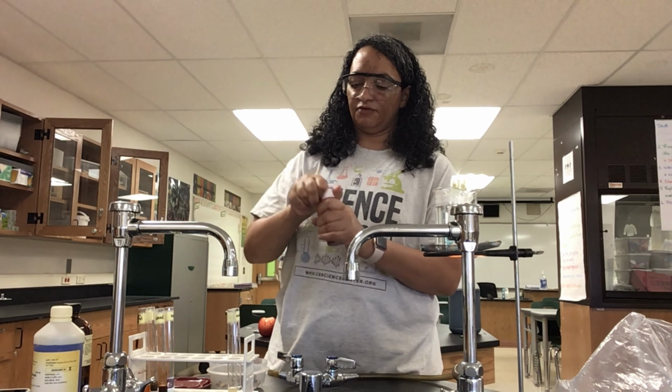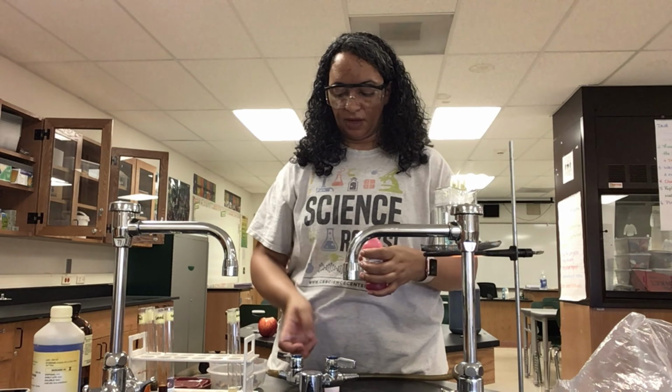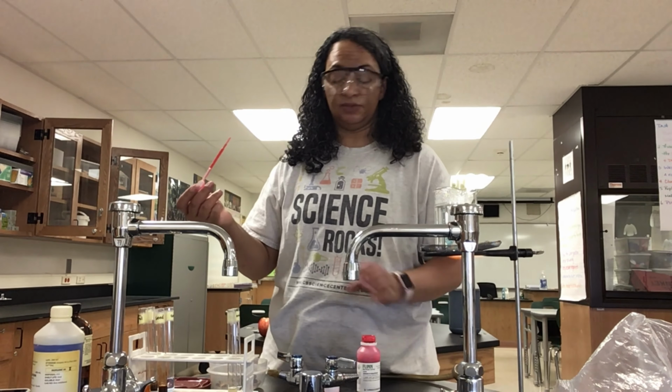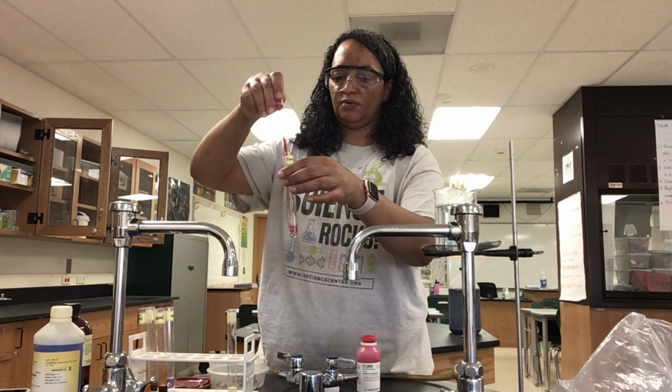So this test is for fats. There we go. It didn't even come off. So I'm going to get some of this. Oh, nice and red, hence the name Sudan Red. Oh, I got it on my hand. I'm going to die. No, I'm not. I'm going to wash my hands here.